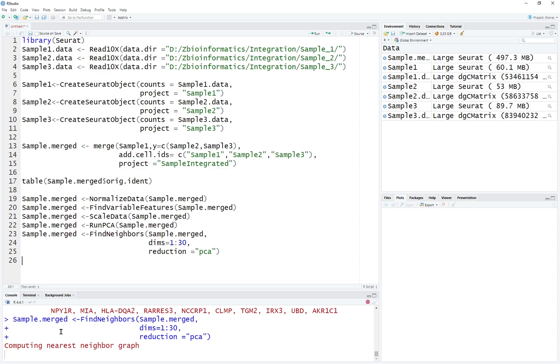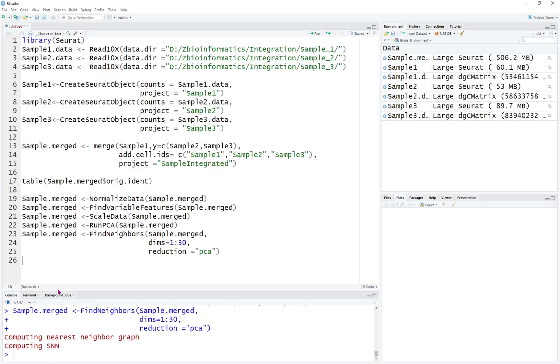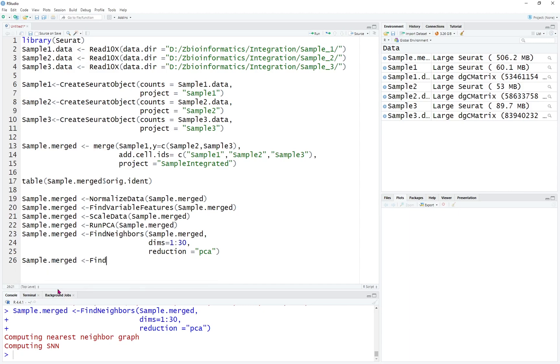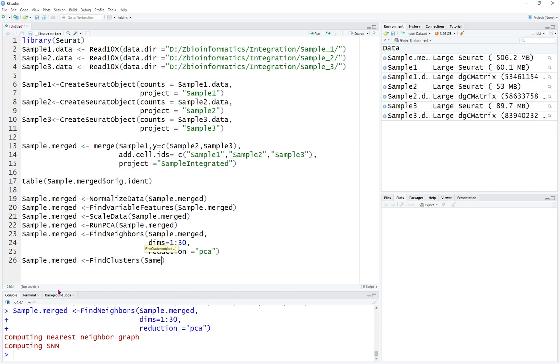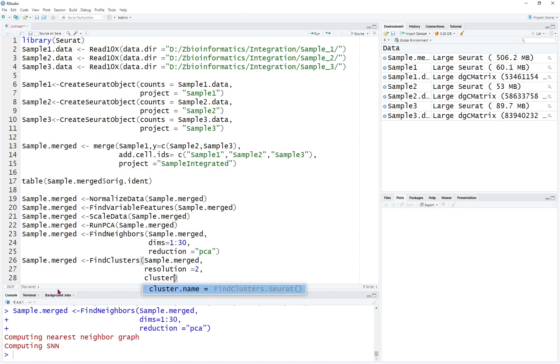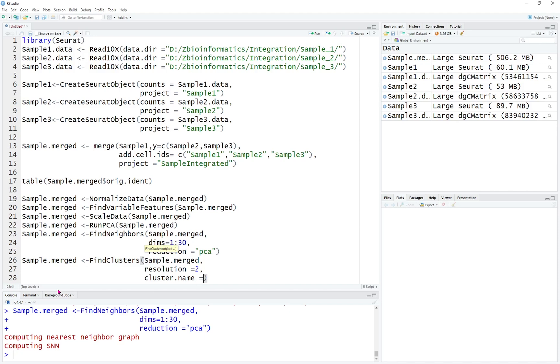Let's run FindNeighbors. Further, we're going to find clusters on sample merged — FindClusters, with data sample merged and resolution equal to 2. The cluster name — you can give it any kind of name. Because we haven't integrated the data, we can simply name it as unintegrated cluster.